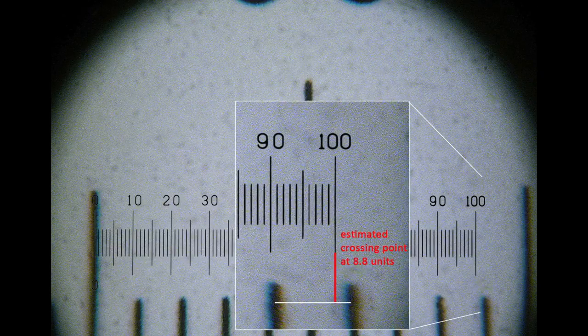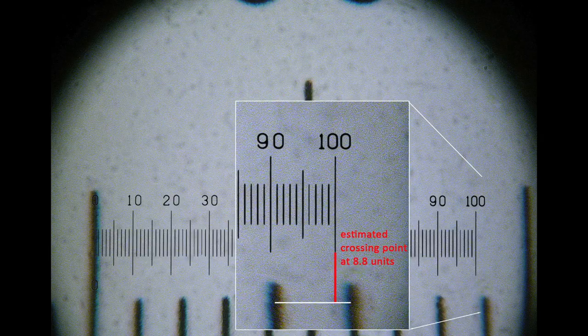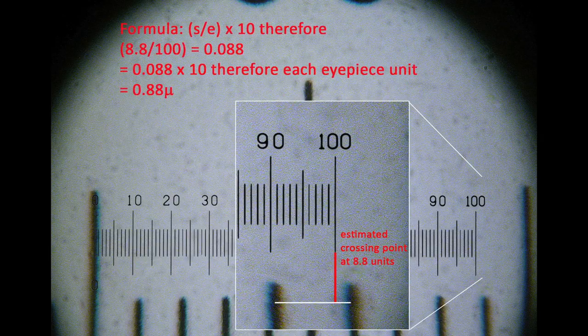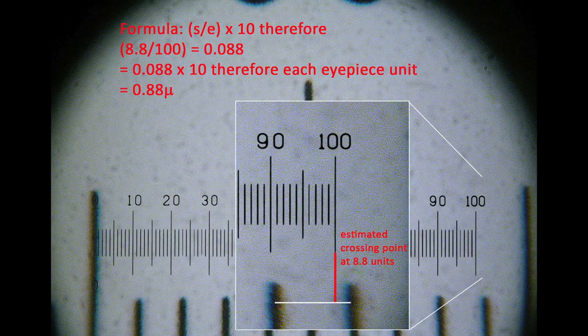So the formula is again applied using this number, and then the value for each IP unit when using this 100x objective is 0.88 microns.